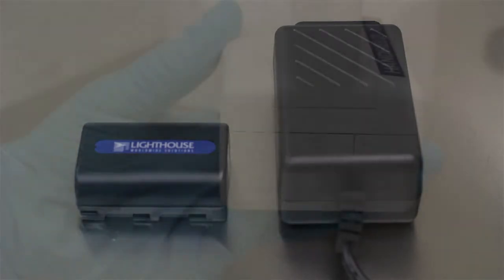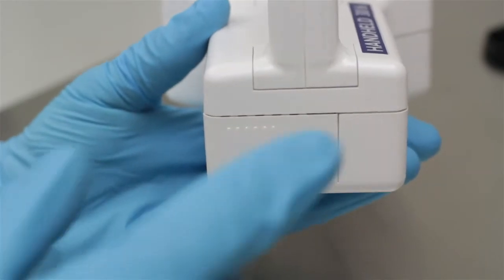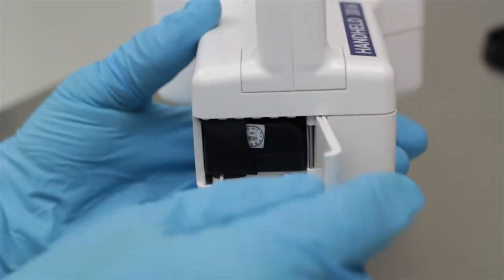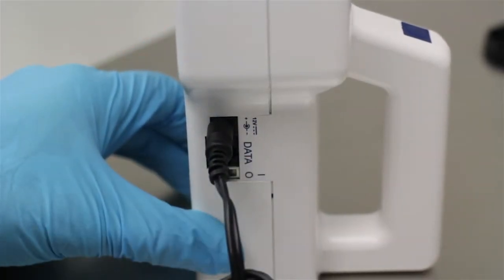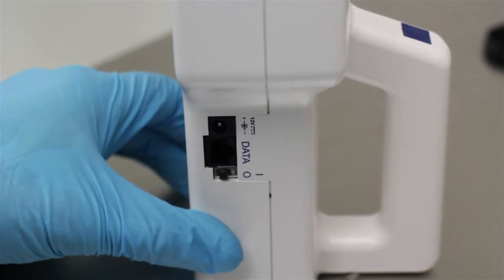Holding the handheld 3016 is shown here. Slide the battery door to the left to open. Pull on the battery ribbon to remove the battery. The battery will charge in the unit while plugged into power via the power jack on the left-hand side.